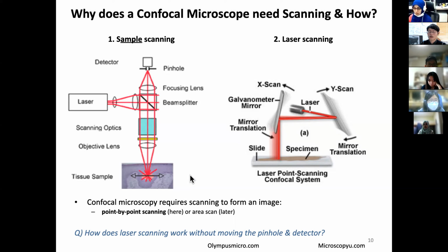But now we've got another problem here. Look at that. Let's put a mirror over here, like a scan mirror, and you move the point to this position. From geometric optics, the corresponding point is not here, but here. But the pinhole is blocking over there. How can we solve this problem? This is a real issue.